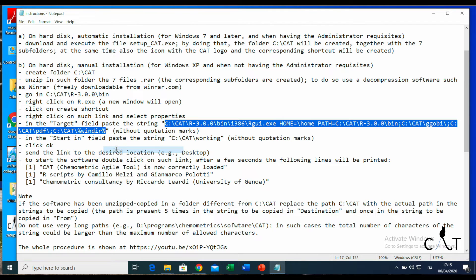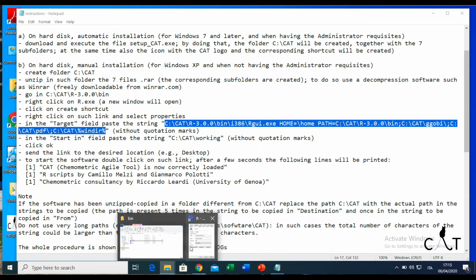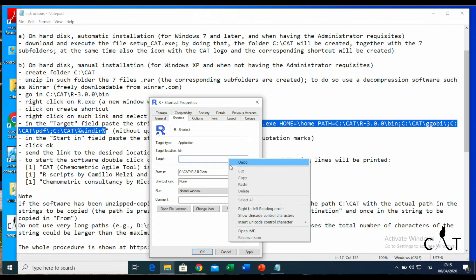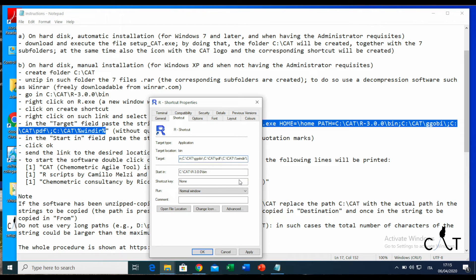We need to copy the string without quotation marks. It's important—without the quotation marks, otherwise it won't work. So we just copy and paste here.